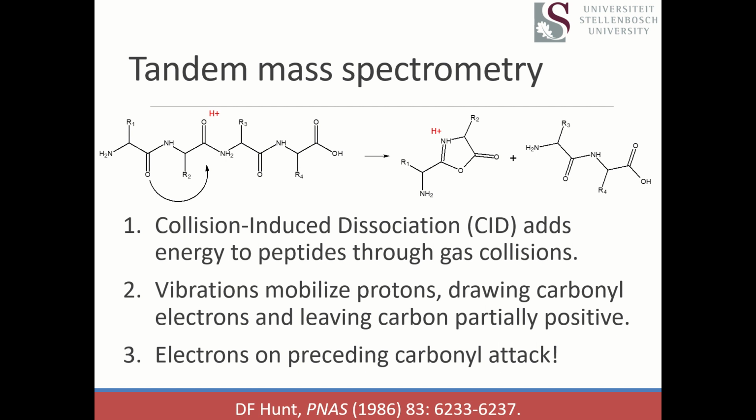Now, there are some unusual things that oxazolone ions can do, especially as we move to higher energy collision-induced dissociation, the HCD methods, or beam-type fragmentation, what you have in triple TOF. You'll see that these B ions can go on to break in more interesting ways. A B4 can become a B3, a B3 can become a B2. B2 ions have their very own chemistry, so they can become very, very stable. So I want you to remember that what's happening to produce these fragment ions is a chemical process, and which amino acids you have where is going to have some implications for how they break.